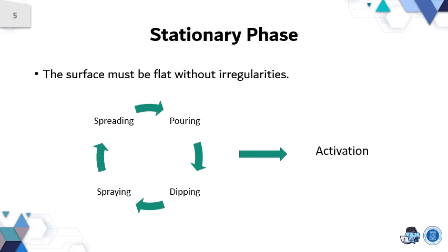After these steps, the next thing that you have to do is the activation. After spreading, plates are allowed to dry in air and further dried and activated by heating to about 100 degrees for around half an hour, like 30 or 45 minutes. By removing the liquids associated with the layer completely, the adsorbent layer is activated.